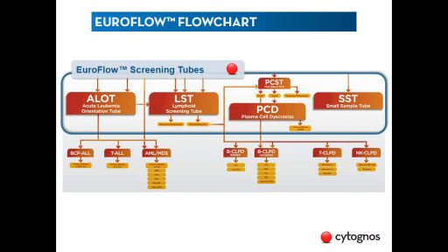First of all, we are going to apply this screening to know what is happening and to discard normal samples, and then we are going to apply the second step just to make the final diagnosis. We are going to see these 4 screening tubes in detail, combinations of antibodies, formats, everything, just to see the advantages.